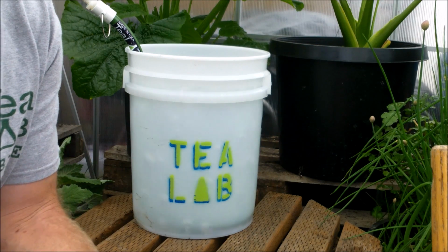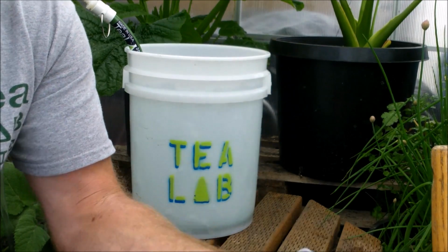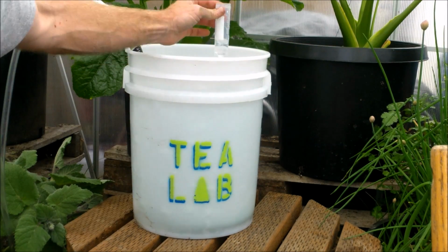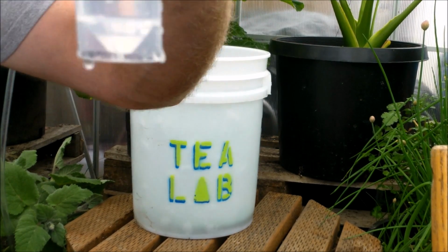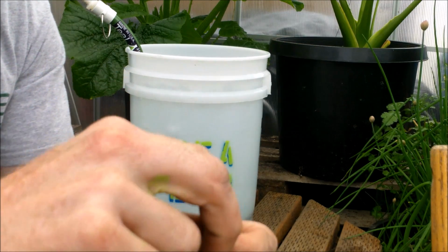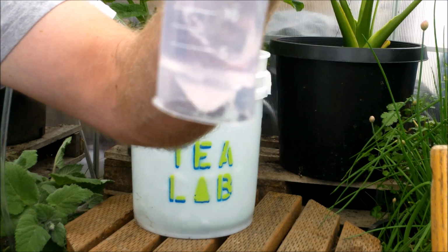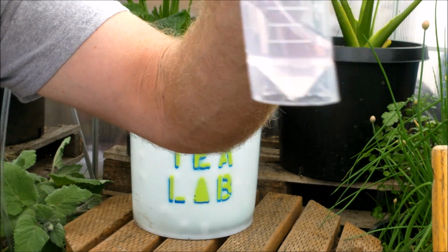Okay, folks, it's hour number 3 right now. It's 4:20, and we are going to see whether the water that we've been bubbling for 3 hours is going to be free of chlorine and chloramine. So again, we have 10 mils, exactly what I'm supposed to get. DPD packet. Pour it in there. Okay, we still got pink color. 3 hours, there's still pinkness in the water. It's definitely getting less and less though. Let's see what it's like in 1 more hour.